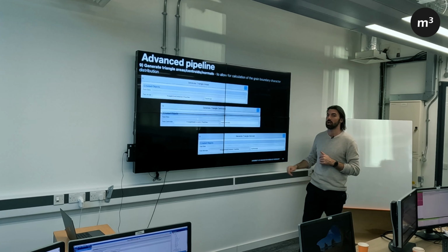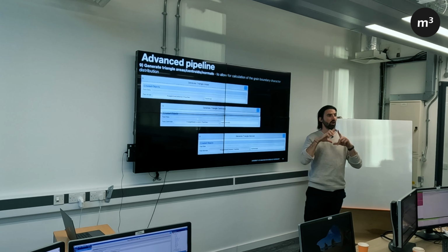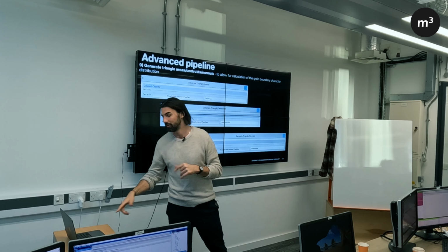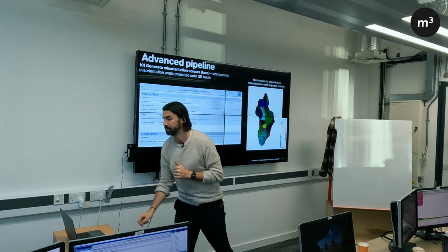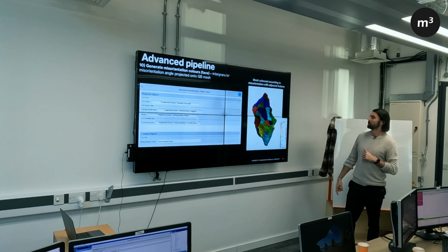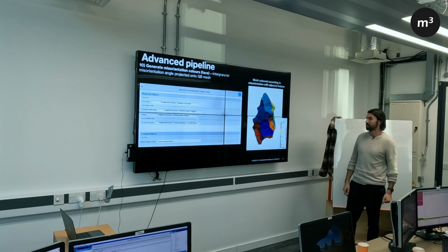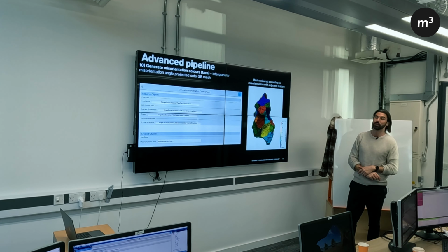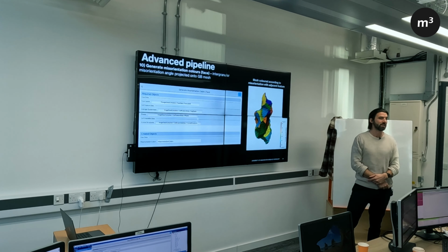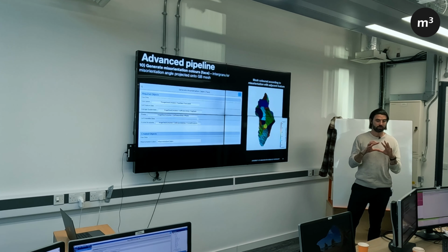So these are three filters which extract properties on the orientation of each face region. Once we've got that, we can do some cool stuff like generate misorientation colors. This is just examples, by the way. You can do loads of other stuff. This is just some examples I pulled out of what you can do once you have this mesh data with all the parameters for each triangle.